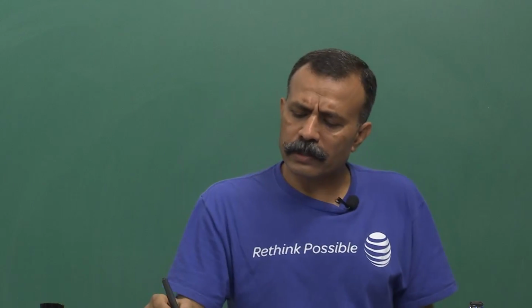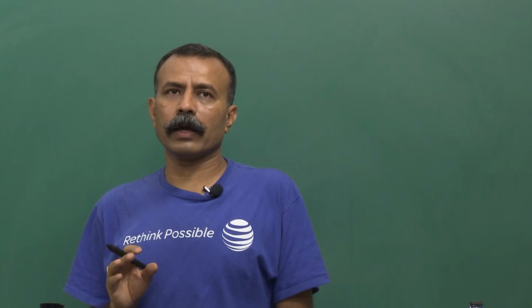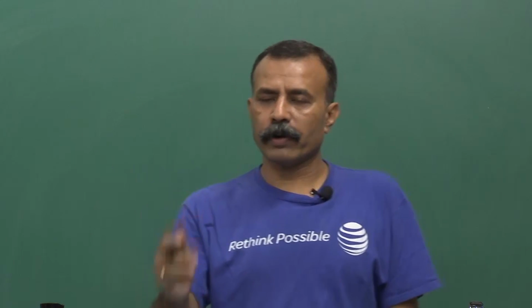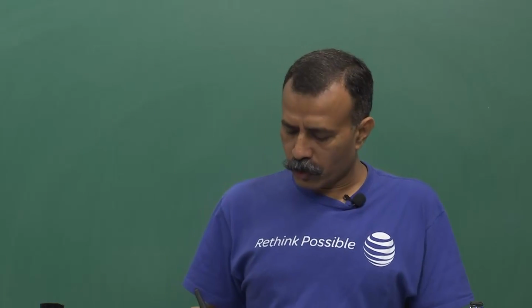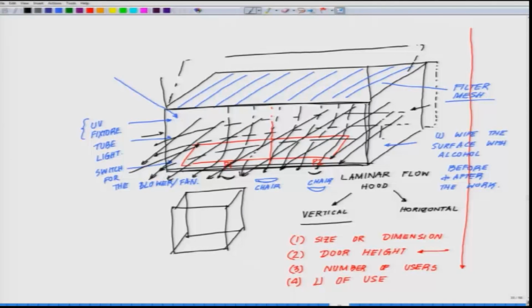Of course, you want to have a bunch of pipettes, which most labs use as dedicated ones for this kind of dissecting hood. I personally used to prefer the glass walls on both sides, where the pipettes can be kept somewhere like this.